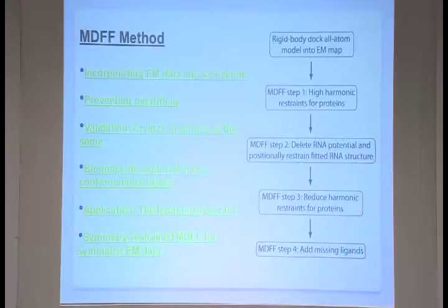Now say for ribosome fitting. The RNA regions are actually more dense. So if you start doing the whole protein, RNA, the whole atomic structure and try to fit it, definitely everything will try to go inside the core RNA structure.